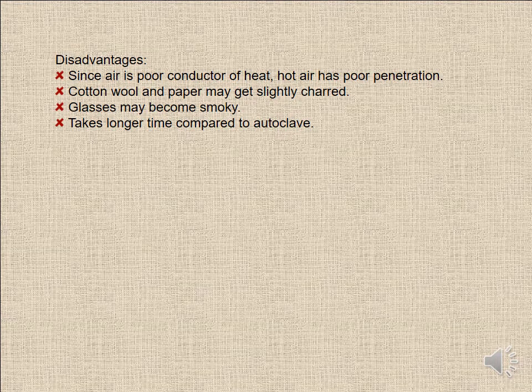Disadvantages of the hot air oven. Since air is a poor conductor of heat, hot air has poor penetration. The cotton wool and paper may get slightly charred. Glasses may become smoky. It takes longer time compared to the autoclave.